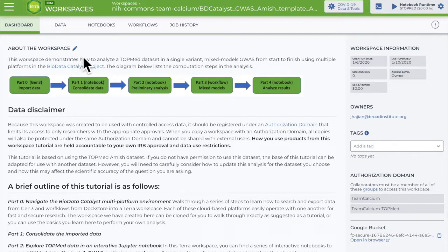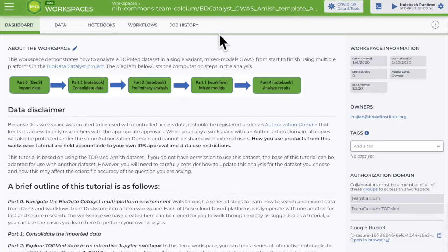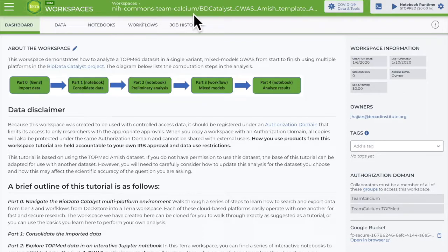To work together, you'll share the project workspace with all your collaborators. Everyone in the shared workspace will have access to the same data, tools, and results. It's important to remember that every collaborator's analysis and storage costs will bill to the same billing project, which is in the workspace URL at the top.